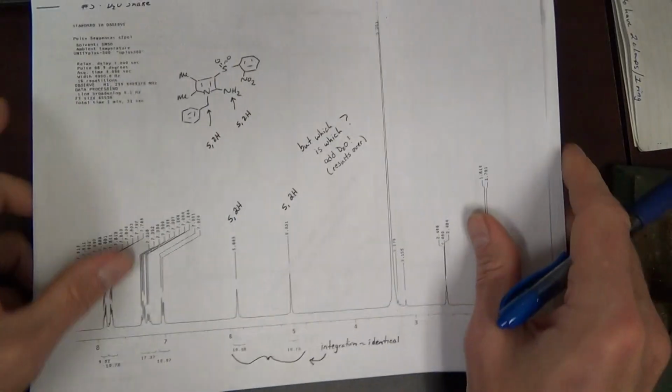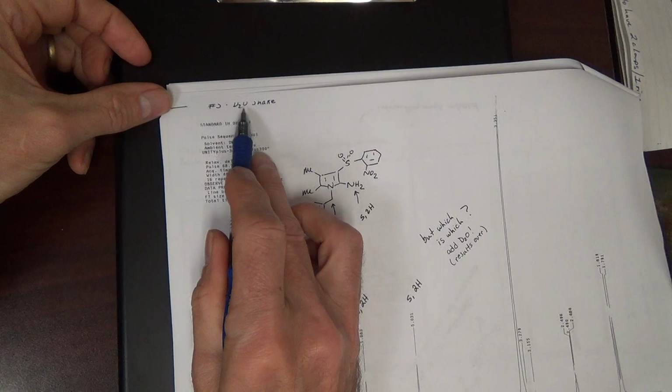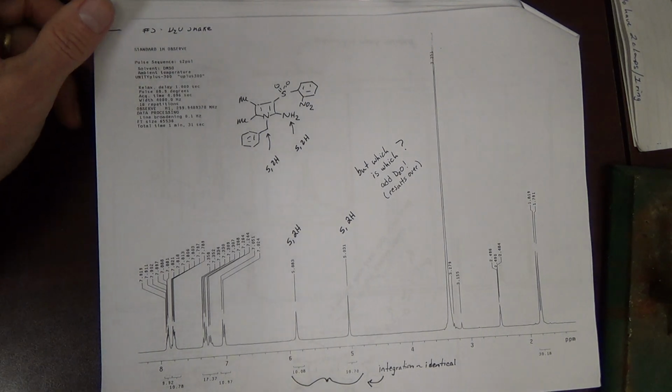Let's turn over here a couple of pages. Not that one. Yes. It says number 5, D2O Shake. It's been cut off up there. This is another compound from my research lab.